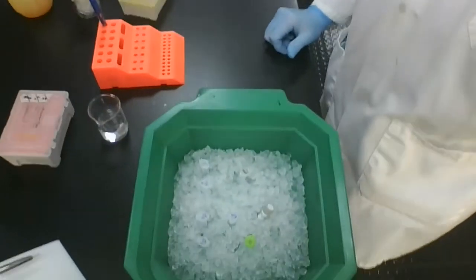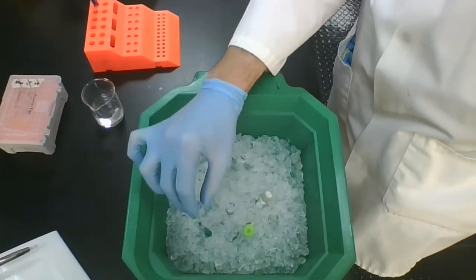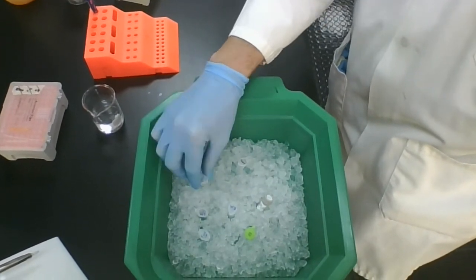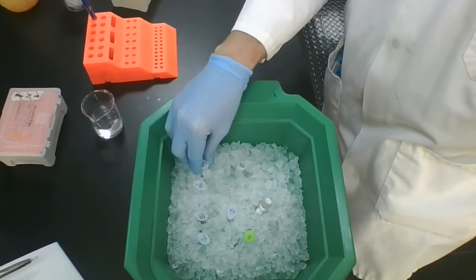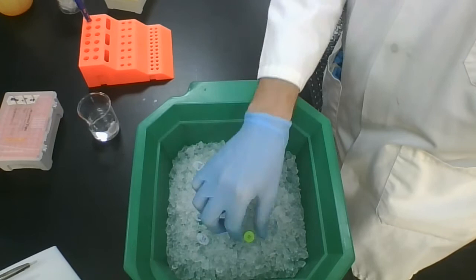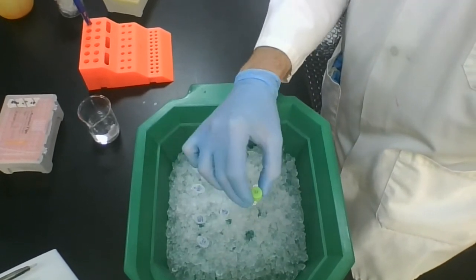When you come into your laboratory, there's going to be an ice bucket containing a bunch of epitubes. One of those tubes will be a forward primer, a reverse primer, some DNA, and some BtDNA — this is your target DNA template. There will also be non-specific DNA as your negative control, a dNTP mix, some magnesium chloride, the Taq polymerase buffer, and the enzyme Taq polymerase.